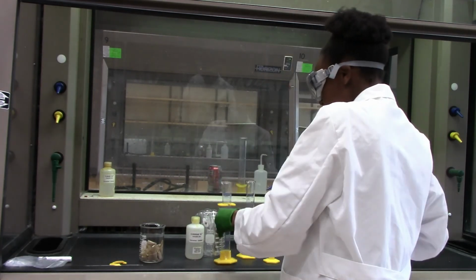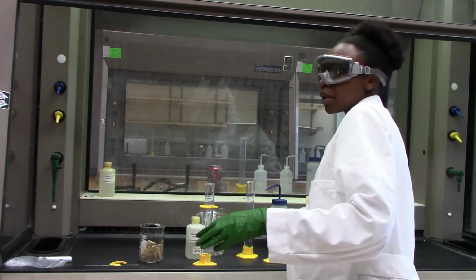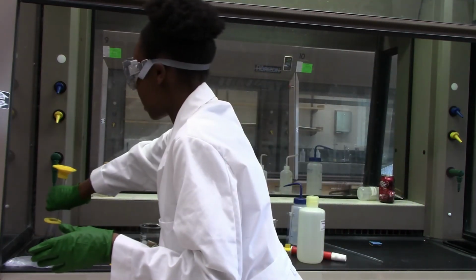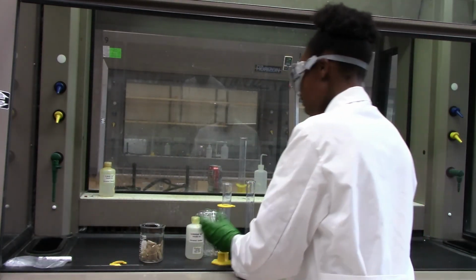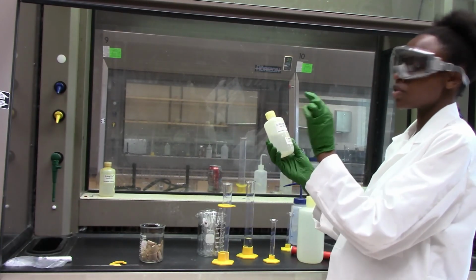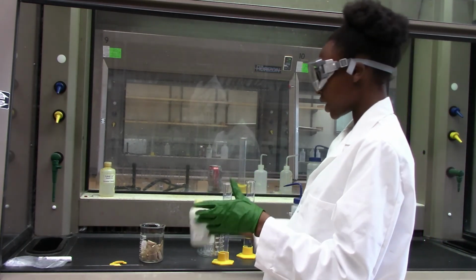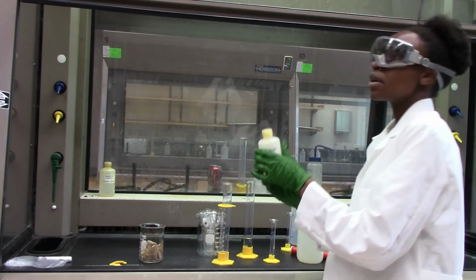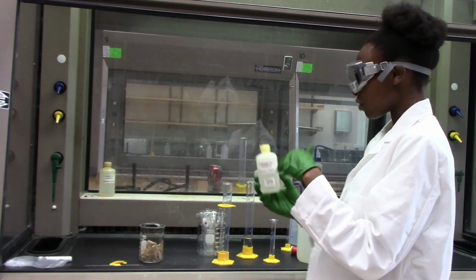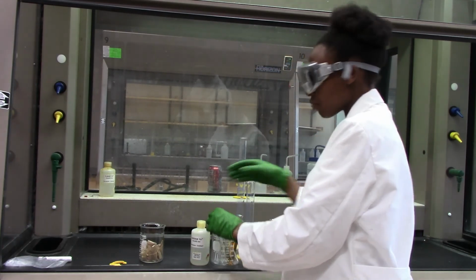And next we will prepare our various equilibrium solutions. I will begin by taking the iron 3 solution, which is 0.002. So this is a bit less concentrated than the one that we used to make our standard solution. So I'll put 5 milliliters of this iron 3 ion into each of my 5 test tubes, so that I have 5 different concentrations of my solutions.